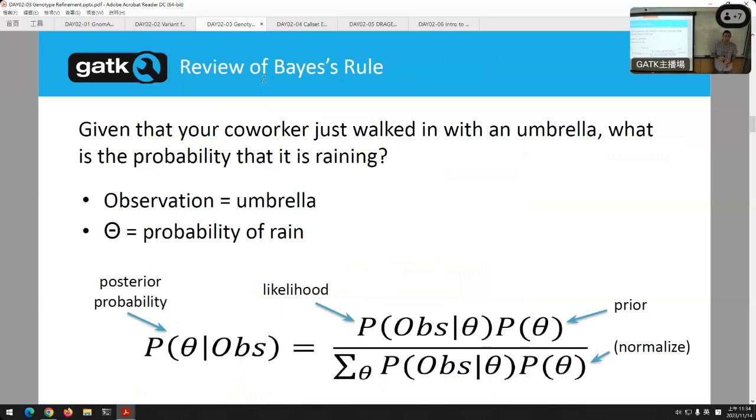Now, the prior probability is the chance of that happening based on, again, an African sample, the frequency in the population. So I know this variant happens in 90% of samples of African ancestry, and this sample is of African ancestry. Well, my prior probability is pretty high that this is a real variant, right? Okay.